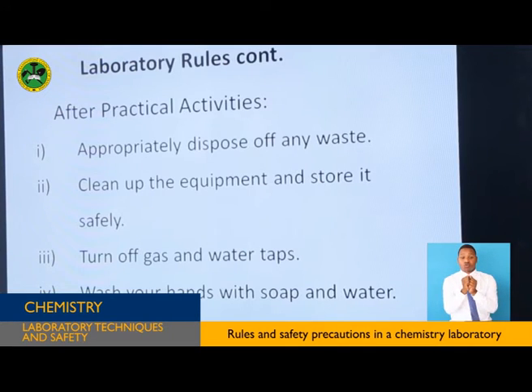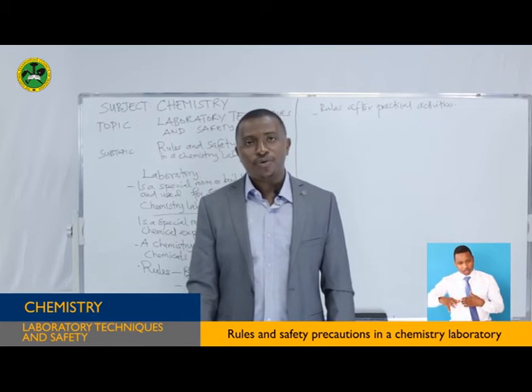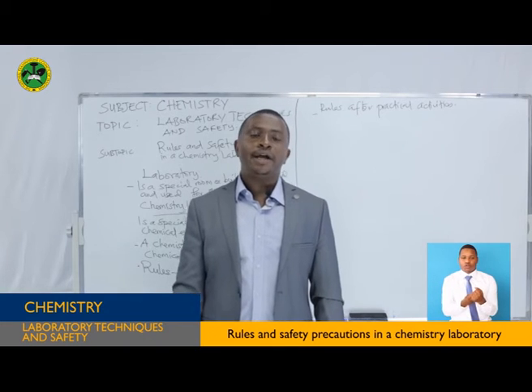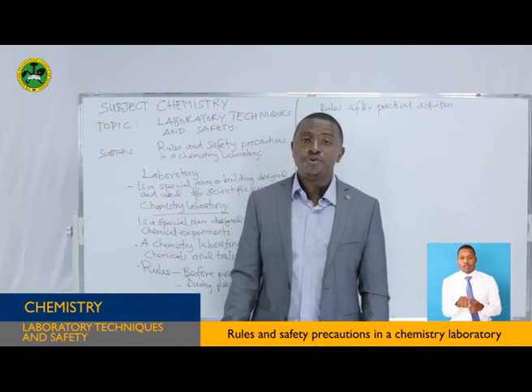Also, number four, wash your hands with soap and water. You have now washed your apparatuses. You now close the water taps. Then you are required to wash your hands with water and soap, under flowing water.